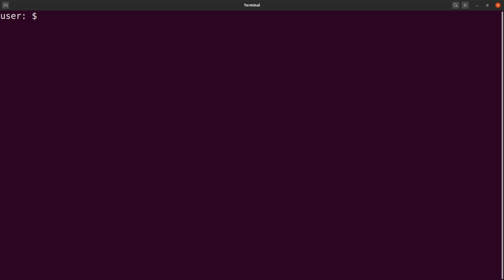We are now ready to do the counts. For the counts, we are going to count variants for all the chromosomes. We are not going to look at specific regions within a chromosome, but the entire chromosome. I'll make a future video where I focus more on the region-based counts, maybe for specific chromosomes. But in this tutorial, we are looking at the entire chromosomes, all variants for a particular chromosome. Now let's proceed. Let's first display the first two entries of the chromosomes text file. Let's say we want to count the number of variants for chromosome 10.